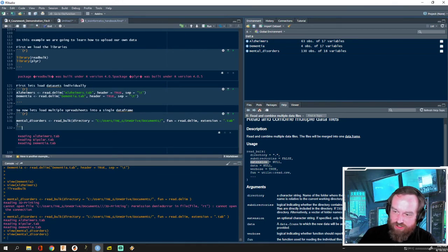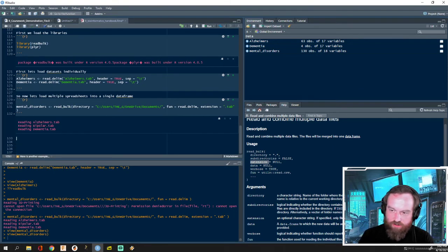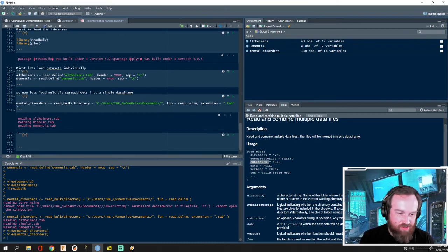So now let's go down here. And just to polish it off, it's no fun to read files without doing anything. We're going to do a simple calculation using our data sheet that we made. So we'll do count, we'll do files.